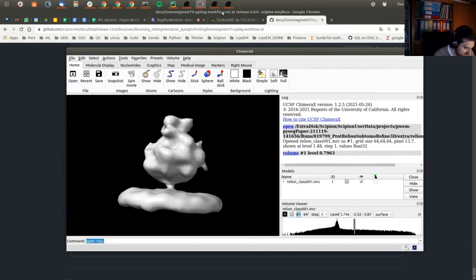So I was very impressed to obtain this with, as Antonio said before, just one tomogram. With no purification, with such a small size, and which means a high sampling rate, and I think it's quite good.